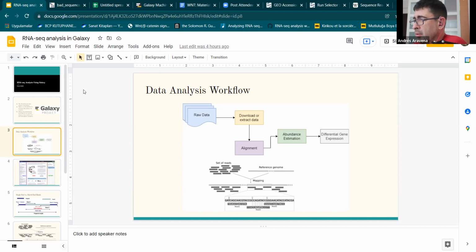Yes. I have a question. I was wondering why you chose to go by the genes and not by the transcripts. Is there a specific reason? Using the transcriptional data, you say? Yeah, annotating the transcripts instead of genes, and doing feature counting by transcripts and normalizing.